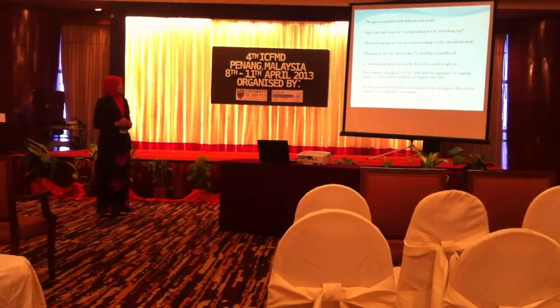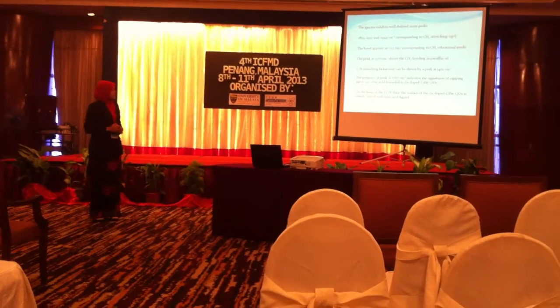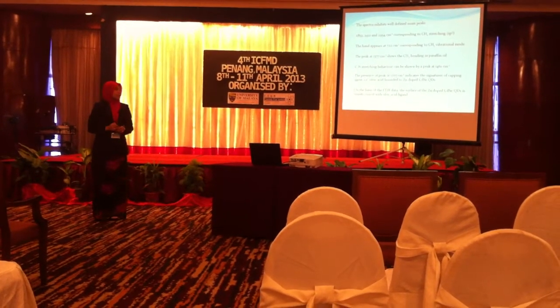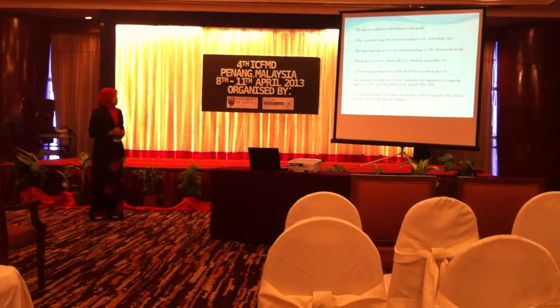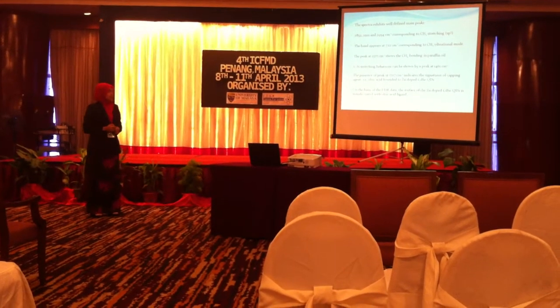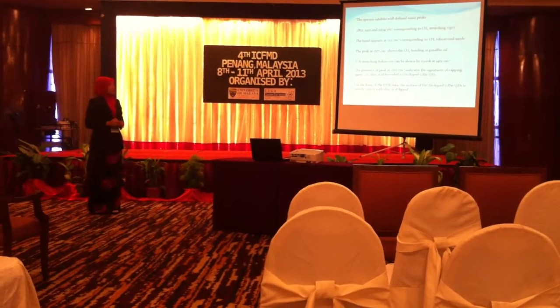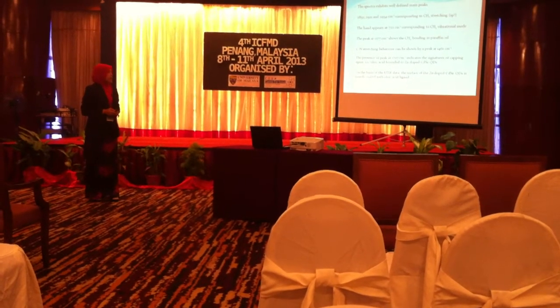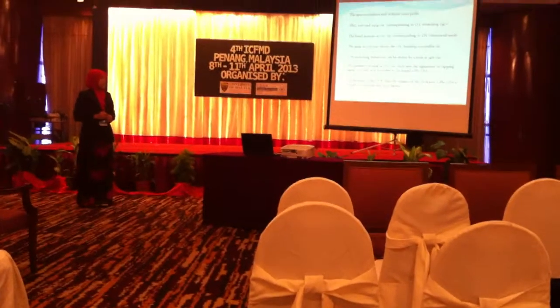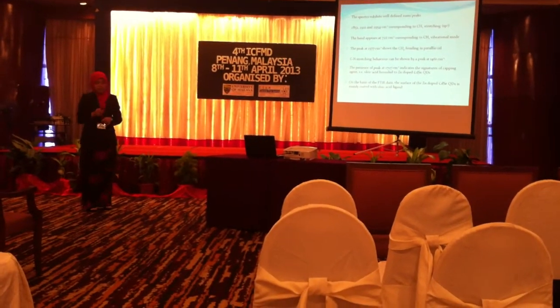The peak at 1377 shows the CH3 bending in paraffin oil. CH stretching behavior can be shown by a peak at 1461. And the presence of the peak at 1707 indicates the signature of the capping agent, which in this project is oleic acid bound to zinc-doped cadmium selenide quantum dots. On the basis of FTIR data, the surface of zinc-doped cadmium selenide quantum dots is mainly coated with oleic acid ligand.